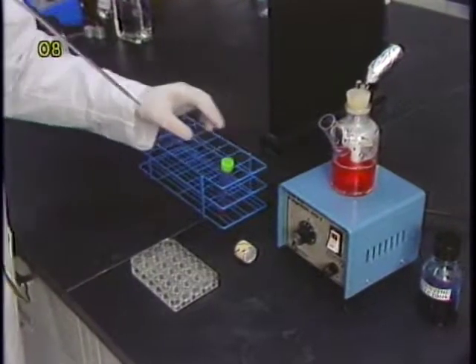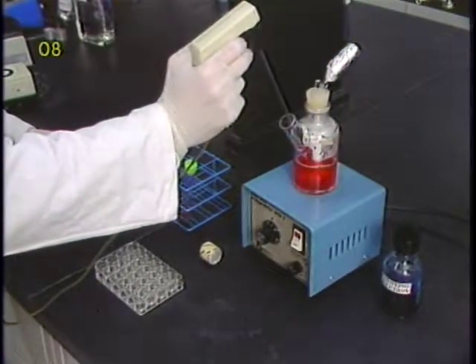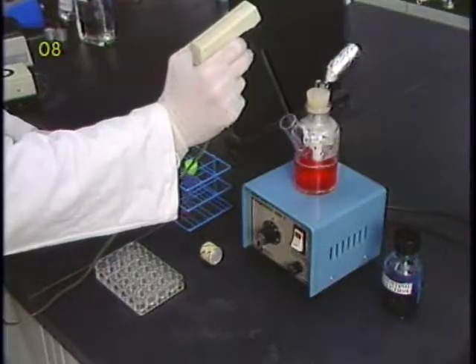As a general practice, whenever a sample is taken for cell count, another sample is placed in a 24-well plate for microscopic observation.